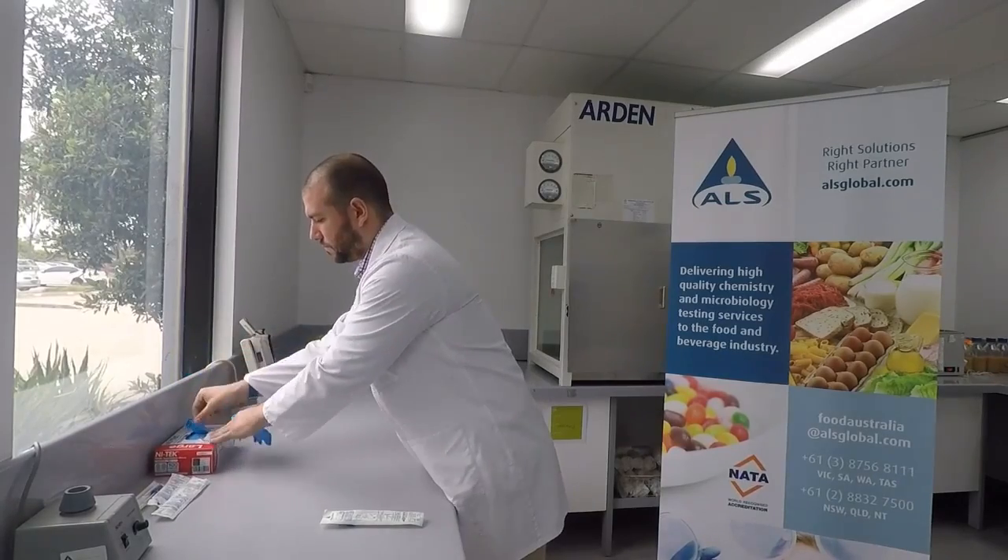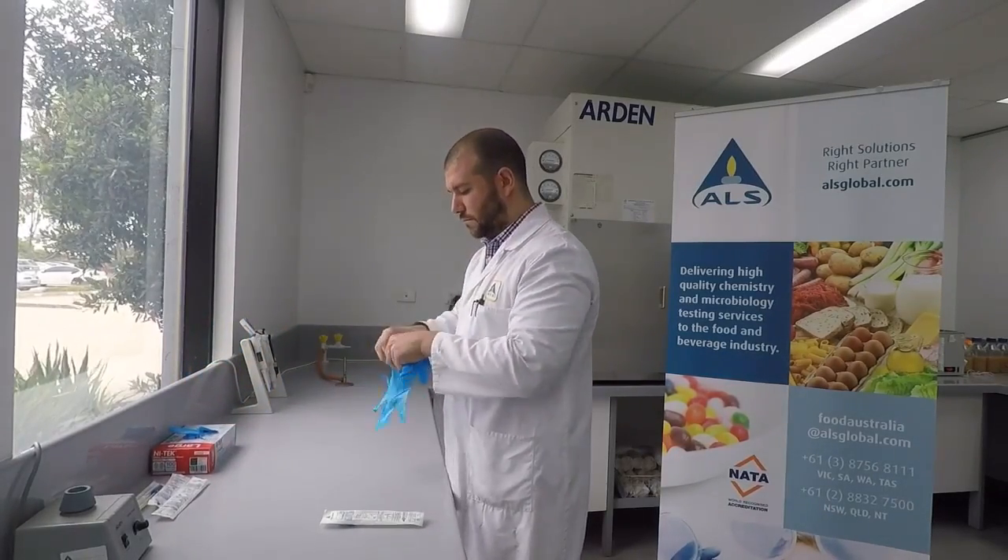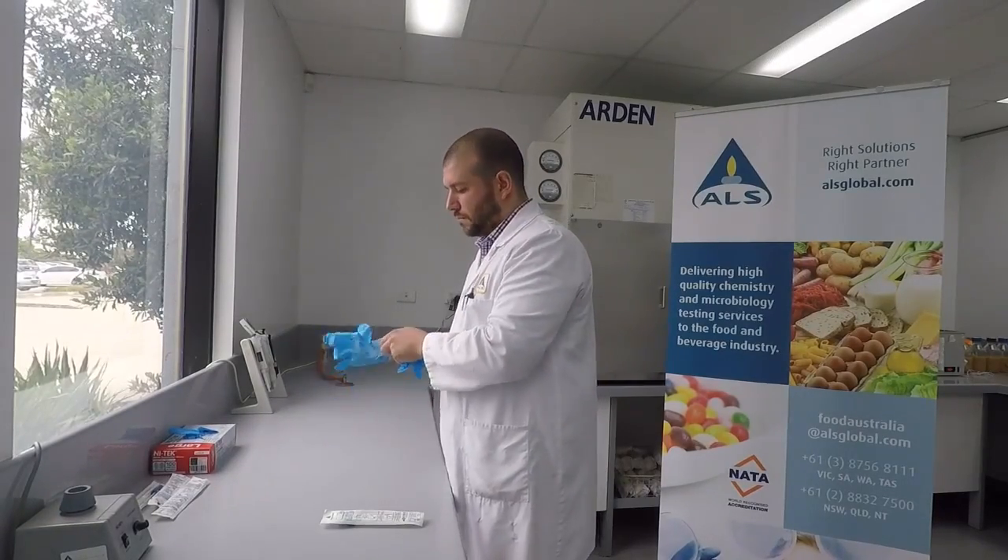Routinely performed environmental swabbing can be undertaken on a number of surfaces, products and materials. This video will demonstrate basic swabbing techniques for a food production area.